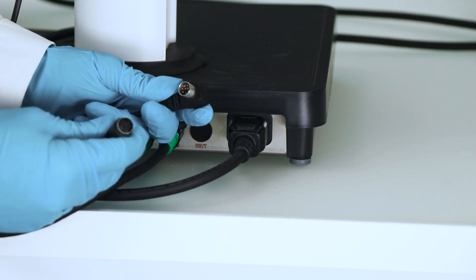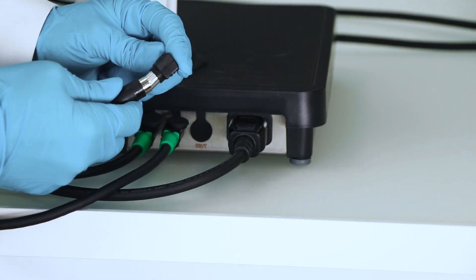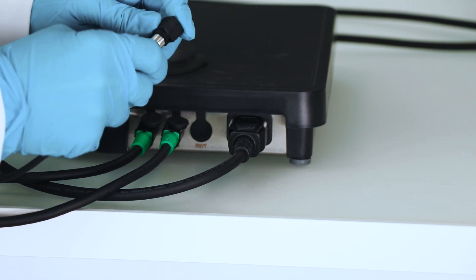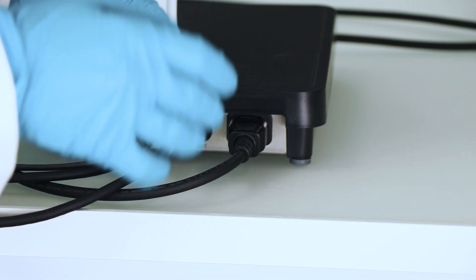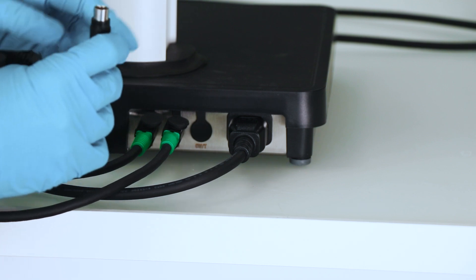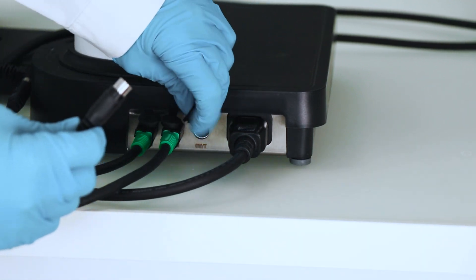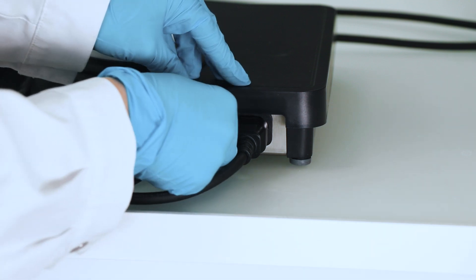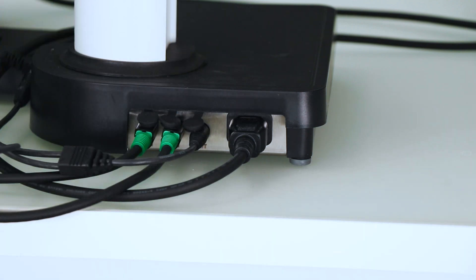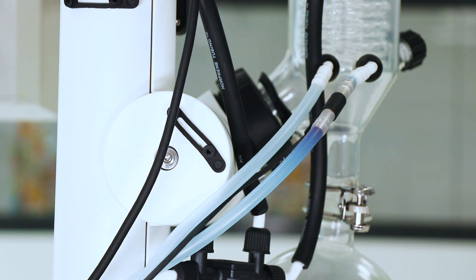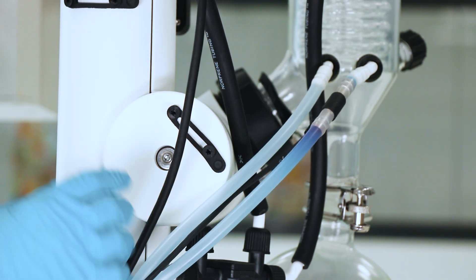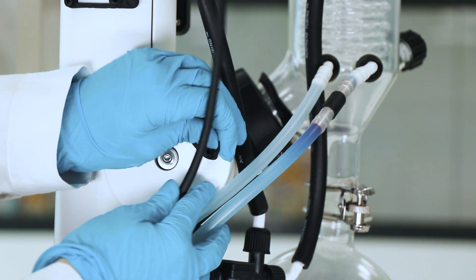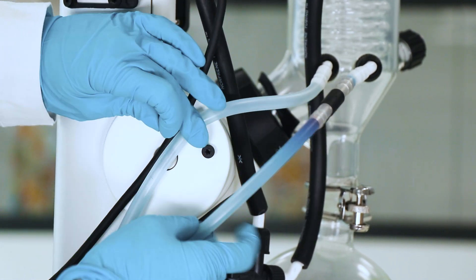So then you connect the water valve to the water sensor. And you plug in the cooling water sensor to the rota vapor here where it says CWT. And now you can organize all your tubes with the tube holders here. So just connect them here.